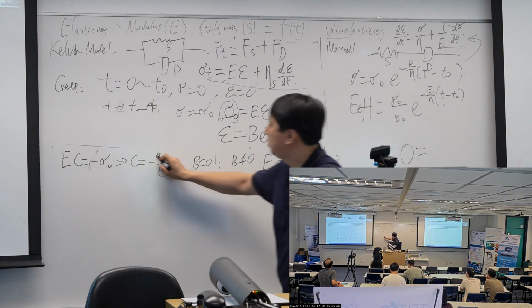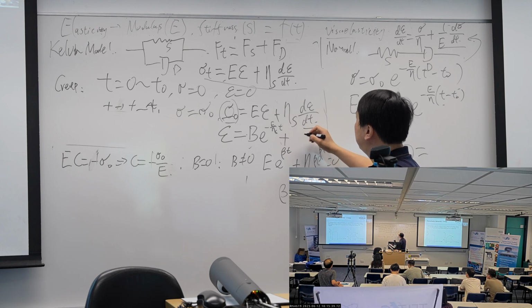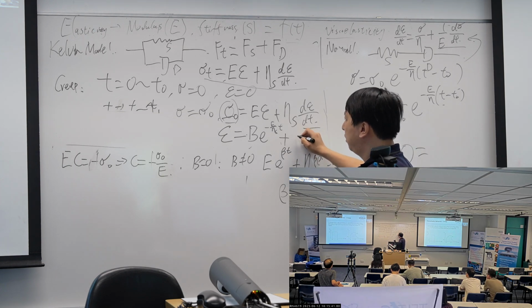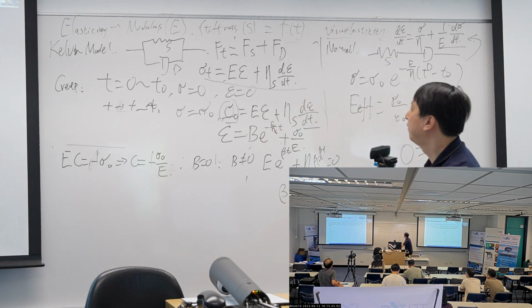Oh no, this is positive. This is positive. That's fine. Plus.